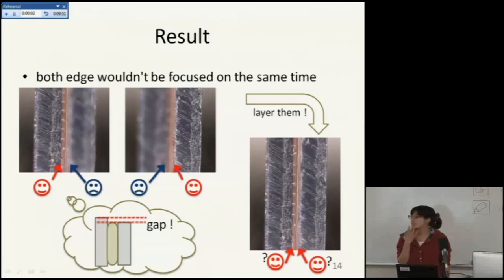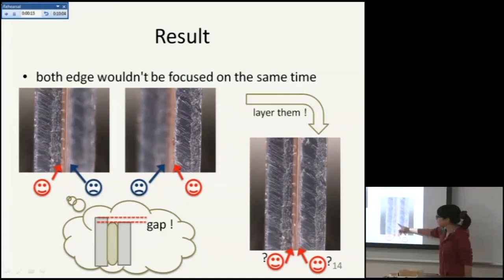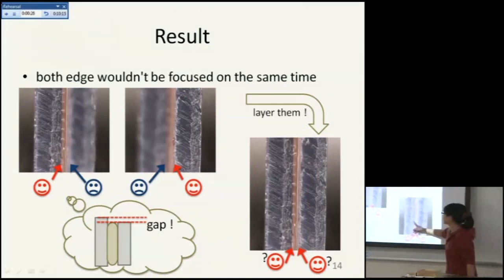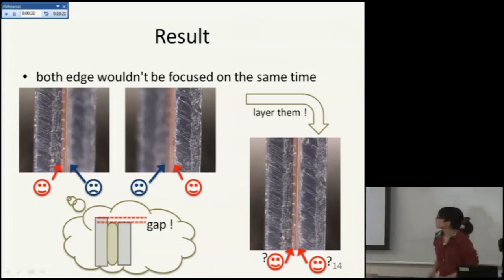And these are the result images I got from the microscope. So this blue one, purple one is the cover glasses, and the center one is a sample which is stained with red. And as I said, I want to measure the aperture of these glasses, but these are still obtained from the microscope.